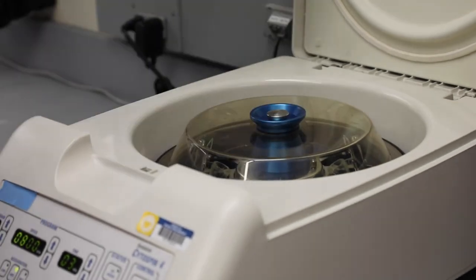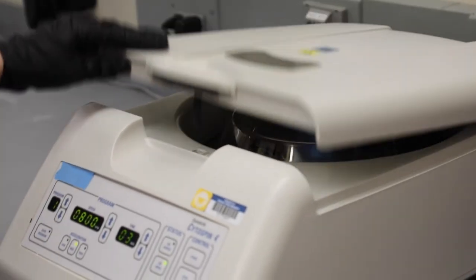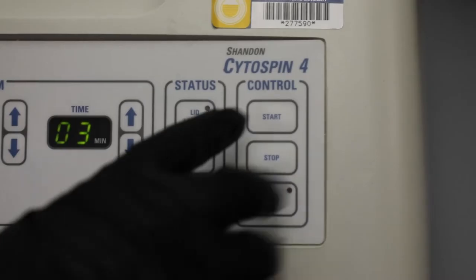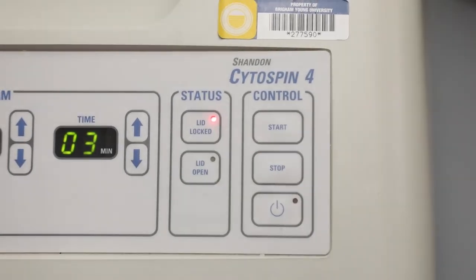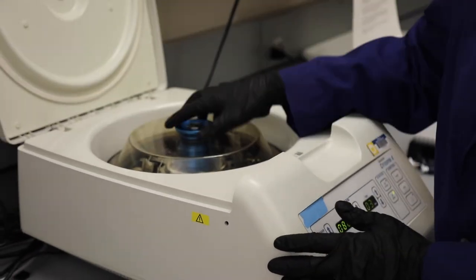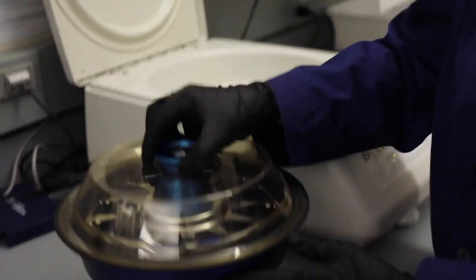For normal eukaryotic cells, ideal settings are 800 rpm for 3 minutes. When the machine is done spinning, a jingle will play. It's then safe to open the centrifuge and remove the rotor.